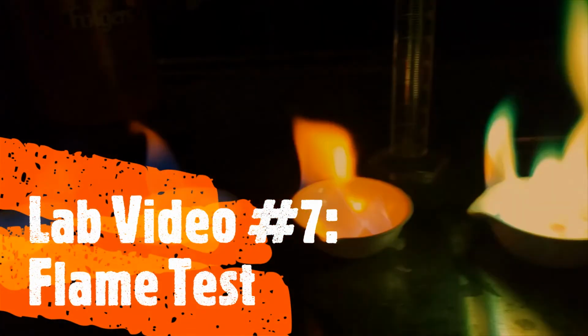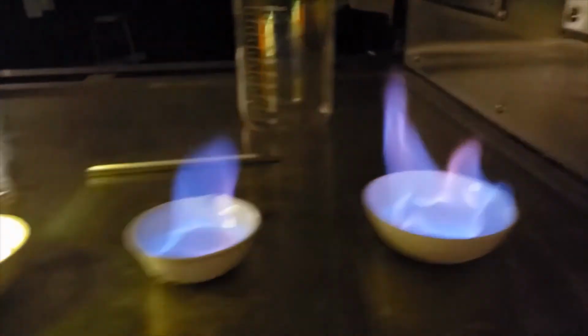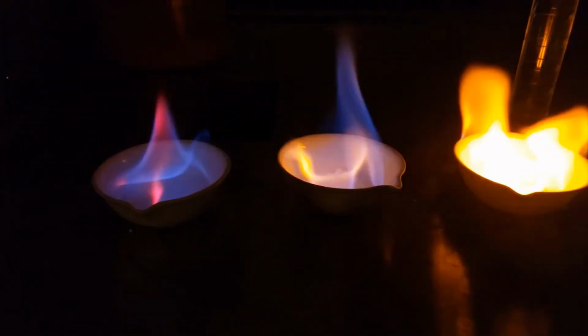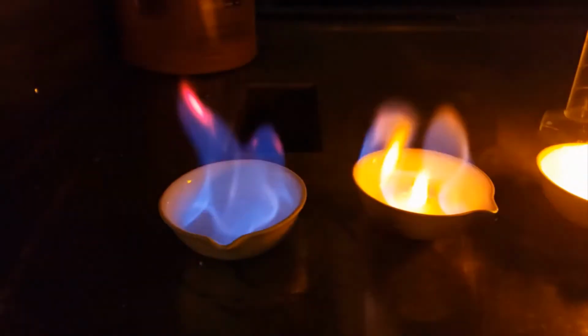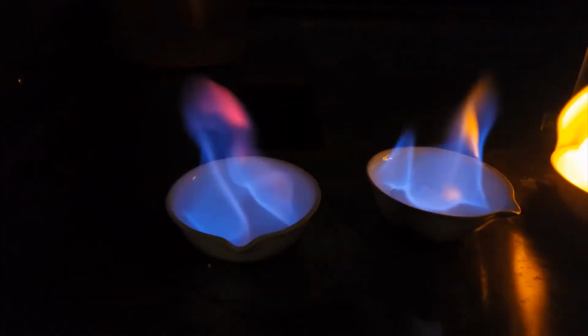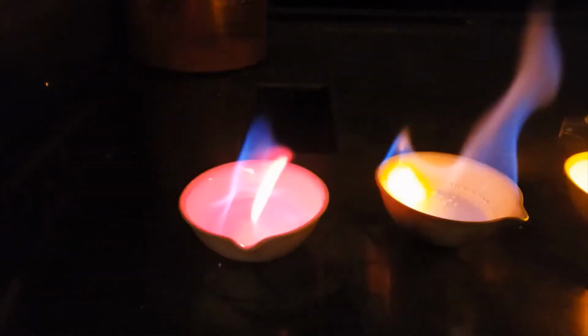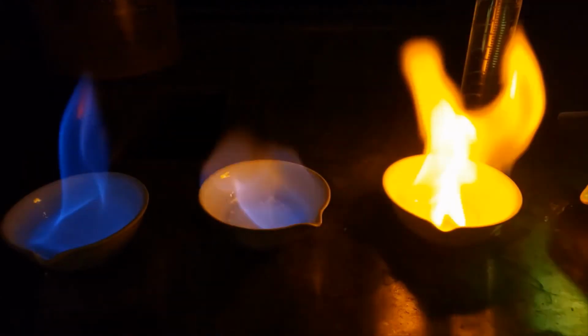Today we're going to be looking at the different colors that elements form when their electrons get excited. Each one of these dishes has a different compound with a different metal element in it. For instance, this first dish has strontium. You can see that strontium gives a very vibrant, bright red color, but it kind of flickers in and out. It's not a very steady flame.